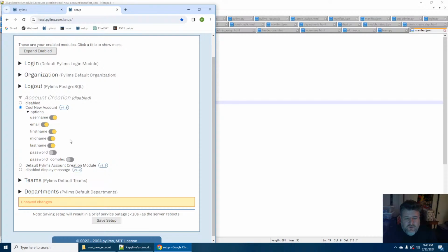You can turn password off so they can just create an account. Maybe you don't want a secure thing, or you just have like a lab or something. I don't know. Again, I don't want to try to think of every single use case. I'm just providing the options. And then something like if you want your password to have to be complex, long and with characters and all that stuff, or if you just want the lower security, whatever. Again, just giving people the options.